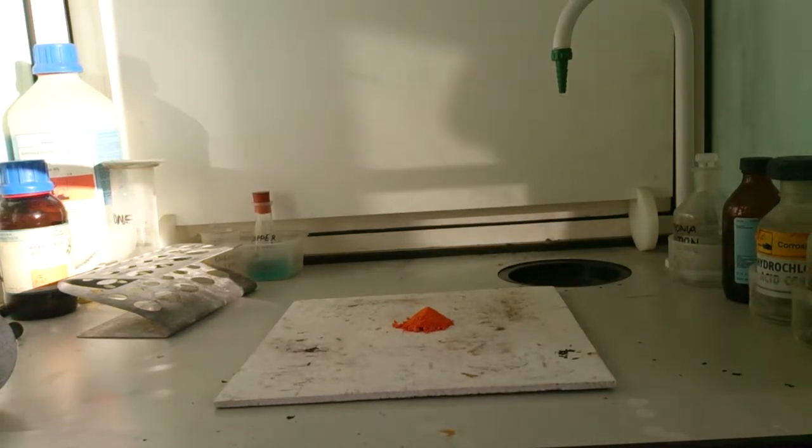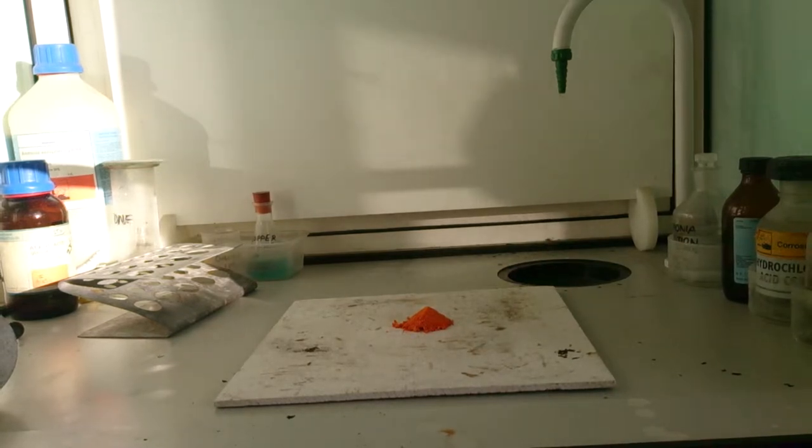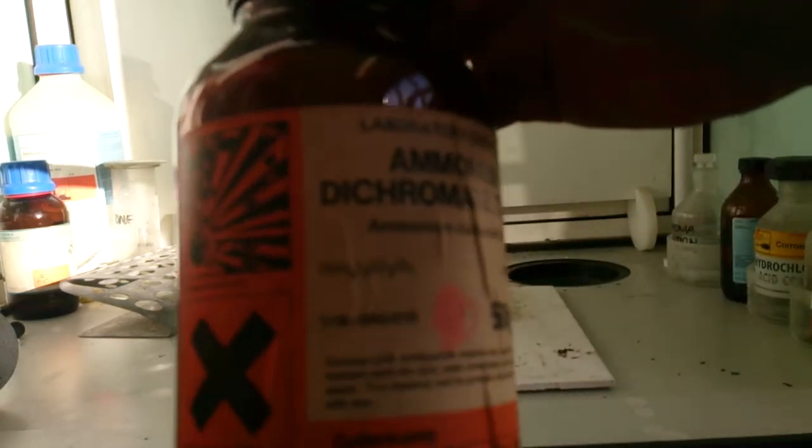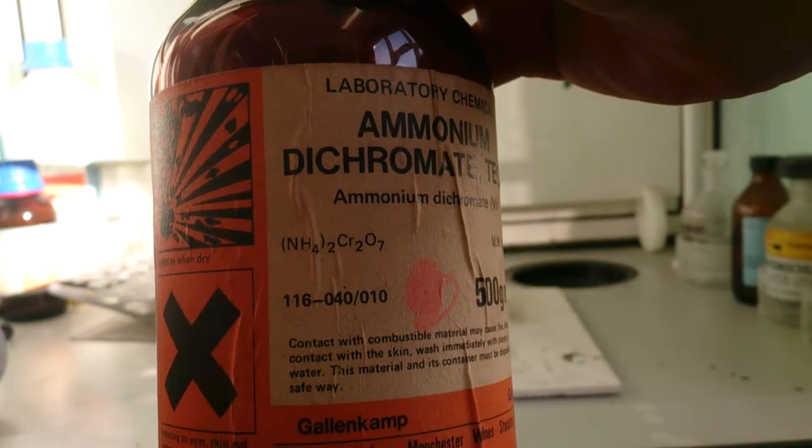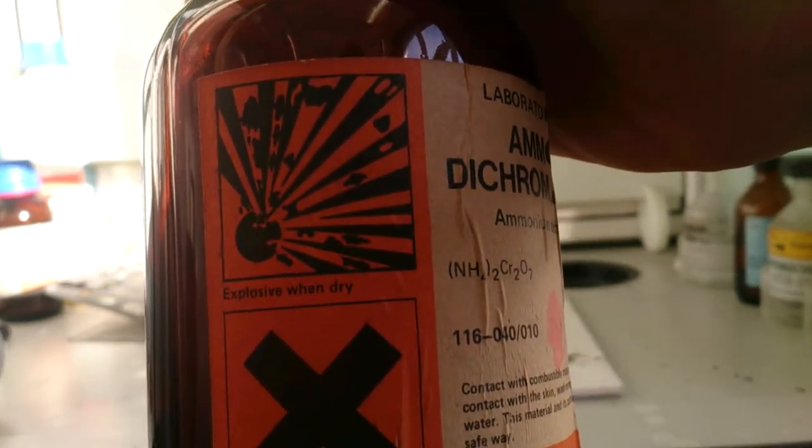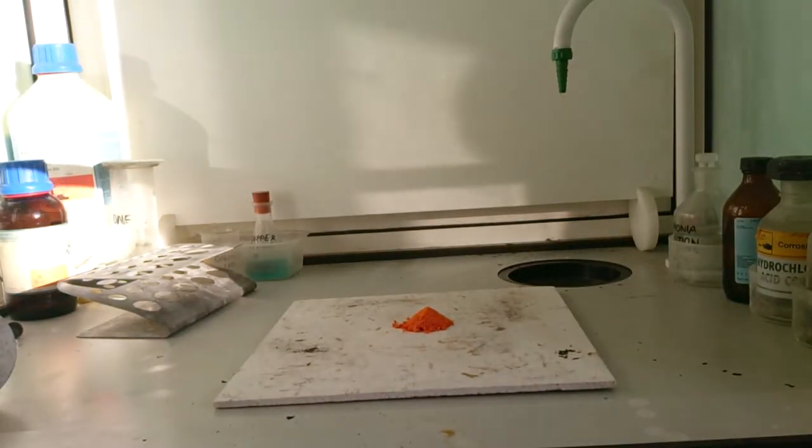Now, the pile that you see there is ammonium dichromate, which is a combination of ammonium and chromium. I'll show you the chemical formula there. When it focuses is NH42Cr2O7. It also says explosive when dry, which that is a dry powder.